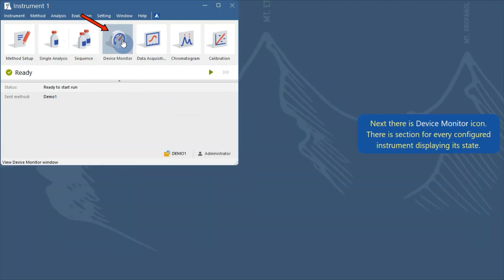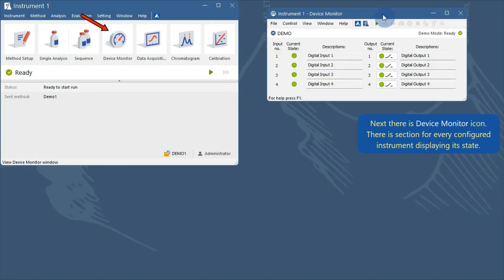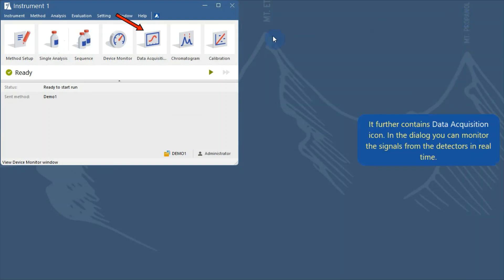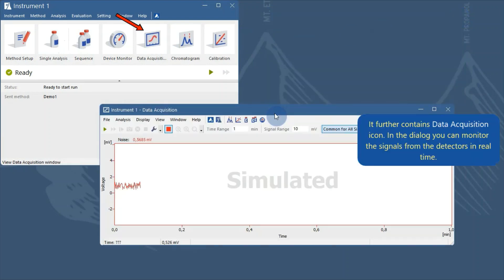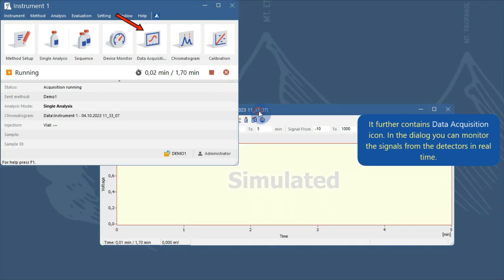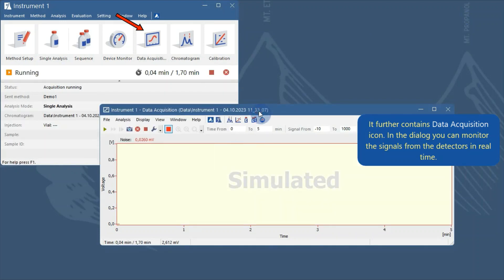Next there is the device monitor icon. There is a section for every configured instrument displaying its state. It further contains a data acquisition icon, where in the dialog you can monitor the signals from the detectors in real time.